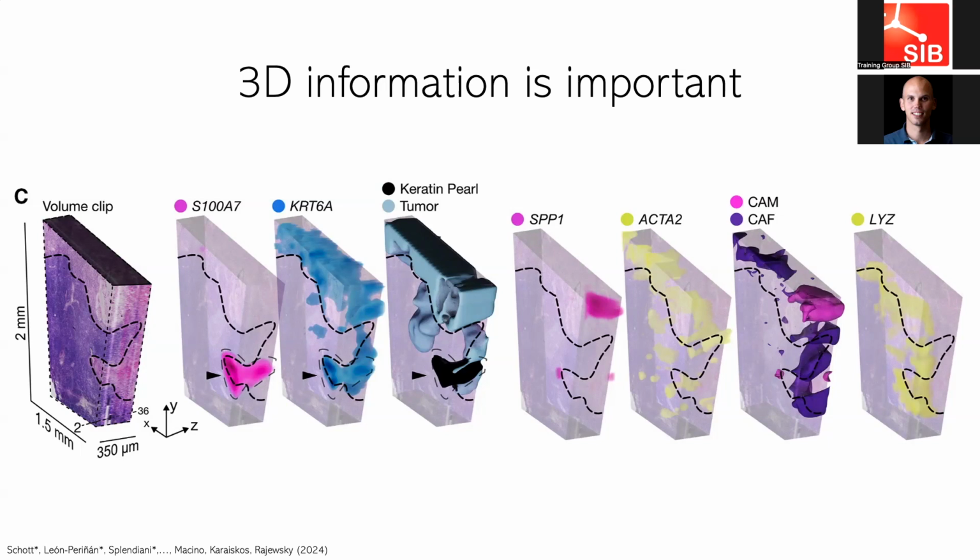I think a little more needs to be done to convince people that three-dimensional relations matter, like building graphs in 3D and showing that the patterns you get from 3D graphs are really unique compared to the ones in multiple two-dimensional graphs. But I think there will be a lot more of this coming.